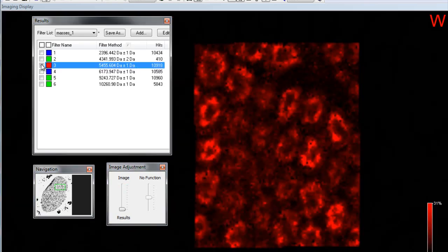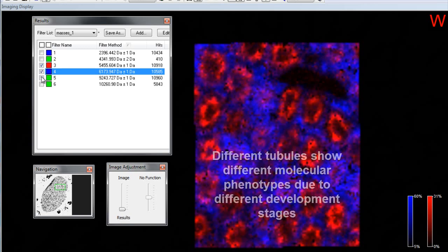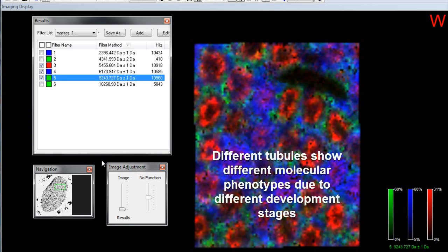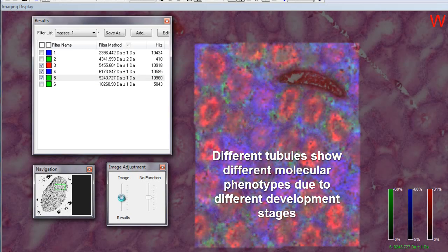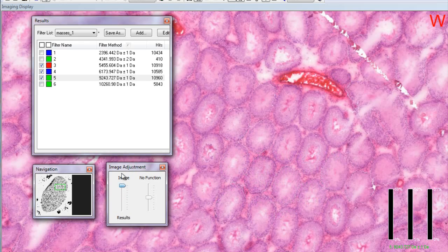Selections of other mass signals show that they correspond to the seminiferous tubules. Different tubules will show different molecular phenotypes due to the different developmental stages present in the tissue.